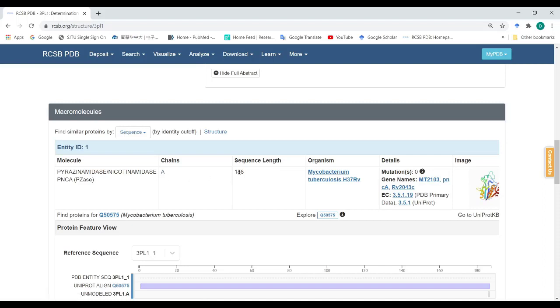This is the abstract of the manuscript and information about the protein. This protein has chain A with a sequence length of 186, meaning it has 186 amino acids and is from Mycobacterium tuberculosis. This is the detail about mutations — this protein has zero mutations — and this is the gene name of this protein.